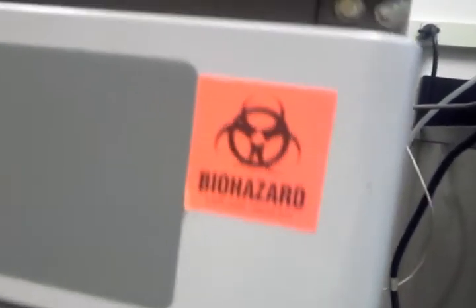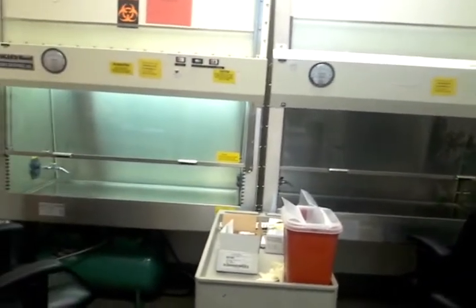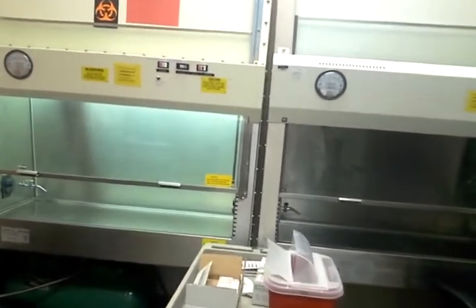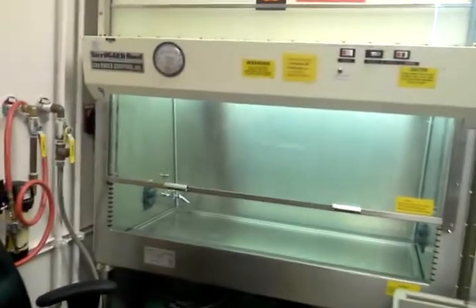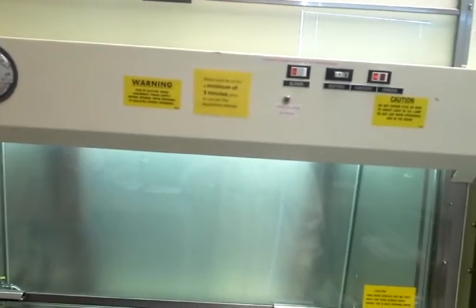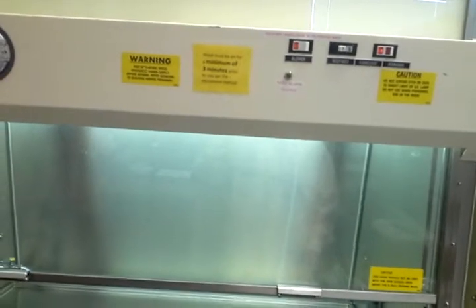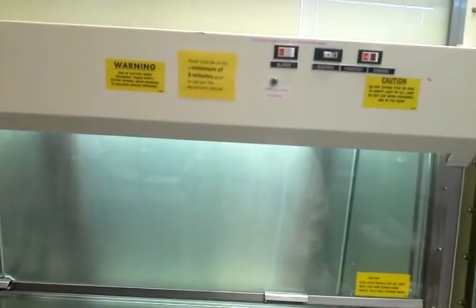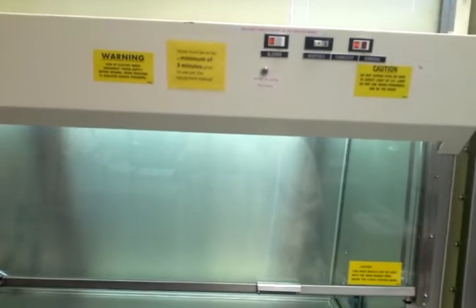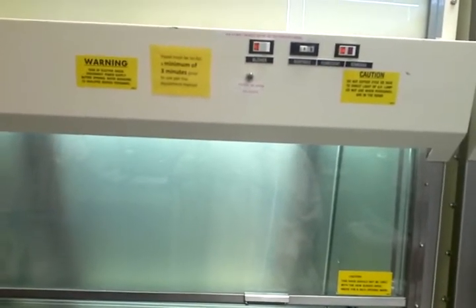I'm currently working in a lab that is designated as BSL-3. It stands for Biosafety Level 3. That means that it's a special lab used for either particularly dangerous organisms or organisms at very high concentrations.